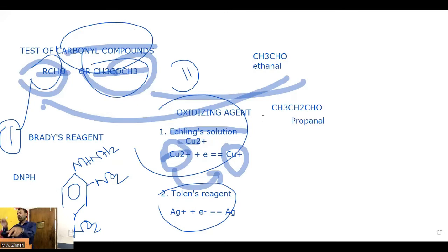Okay, and there is a way to distinguish or identify compounds by measuring boiling points. If it's a liquid, you can use it for water. Water boils at 100 degrees, right? That we know. If you have a doubt about a liquid, and you want to test whether this is water or something else, then we can identify it by determining the boiling point.